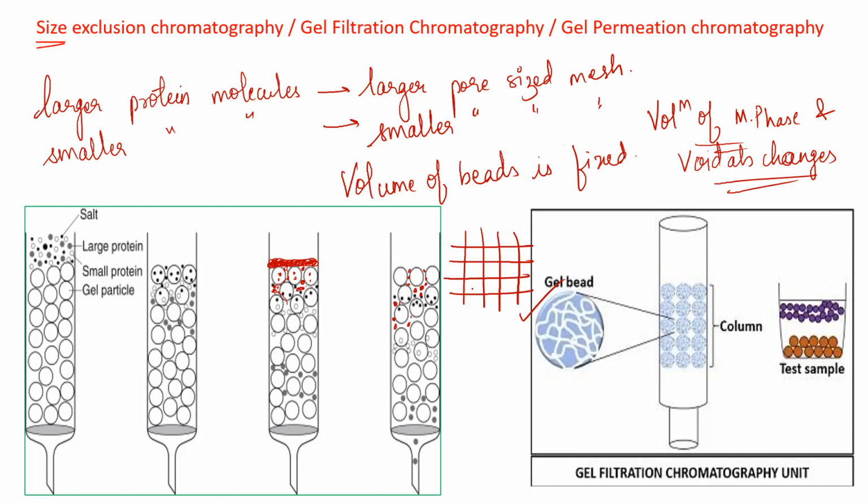No, it is not straight. If it was straight, then it would be very easy for the molecule to pass, because it would just go past in a straight path. But because it is zigzag, your molecule may enter from here and then pass like this. It will take a course, a route, and then finally it will come out somewhere like this.